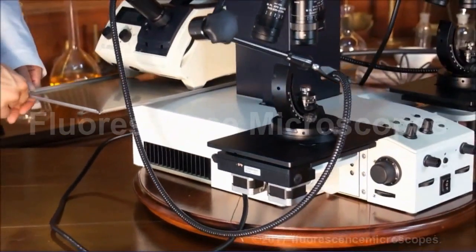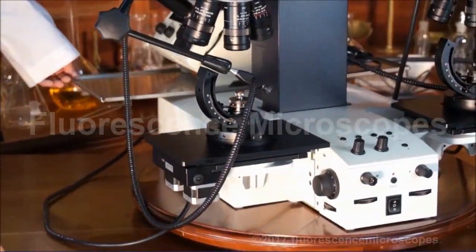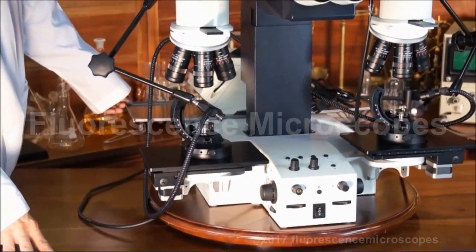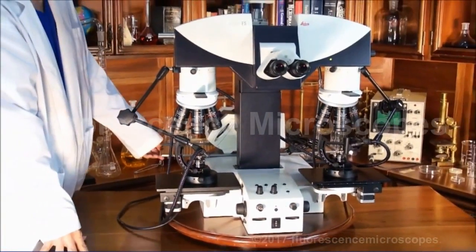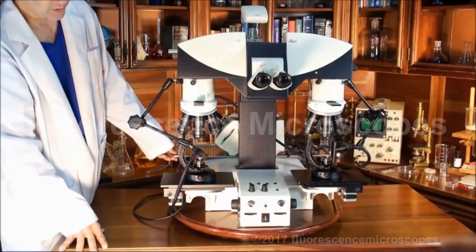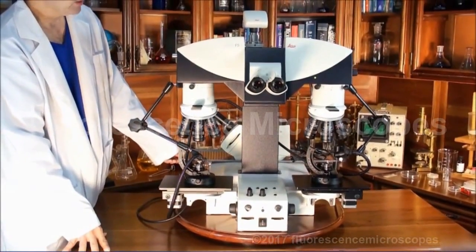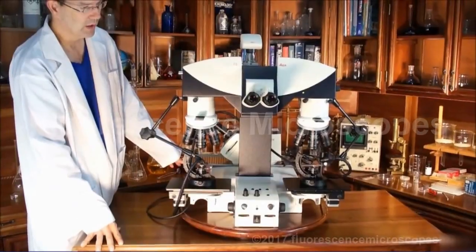Overall, this is a very clean, good quality microscope. We can compare this to an older version such as a DMC. This is a lot better quality.